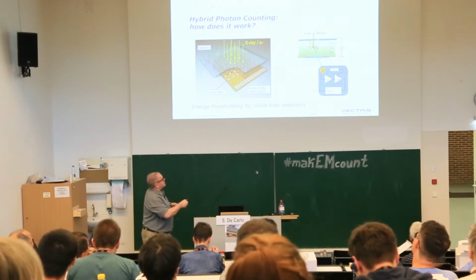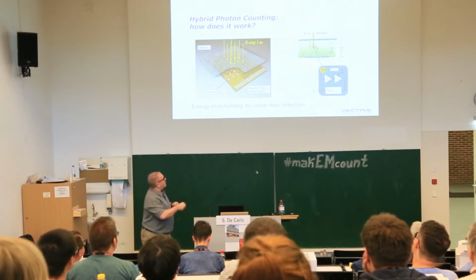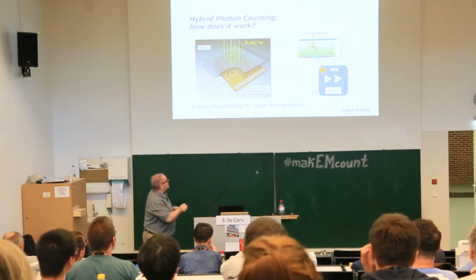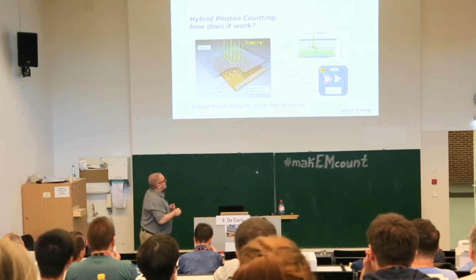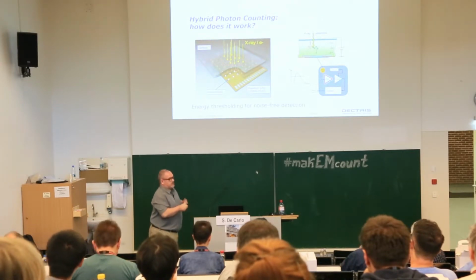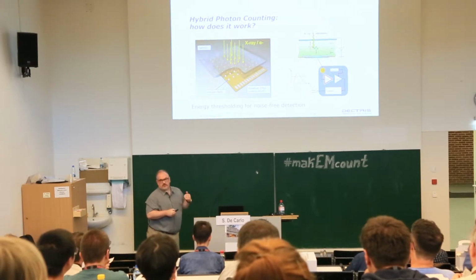The charges, so X-rays or electrons, are captured by the sensor. Electron-hole pairs are created, and you have a rapid drift thanks to a voltage bias or a field that is applied, such that the signals are rapidly drifted through the ohmic contact, and here at the level of the bump pad, you then have the registering of a signal. This is amplified, and this is then compared to internal calibration voltages, which is represented here by the comparator, and the user has the ability to set an energy threshold, and if your signal is above this energy threshold, you get a digital count. If it's below, you get nothing.